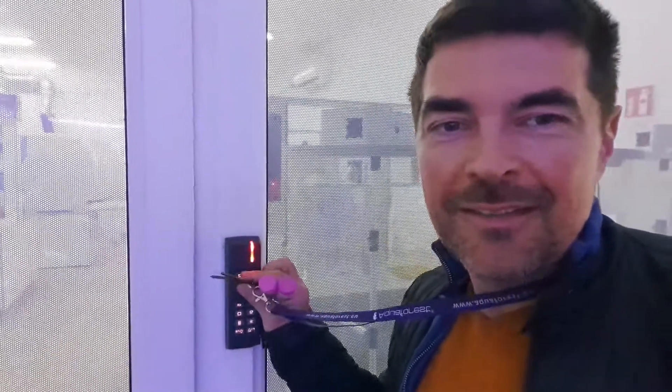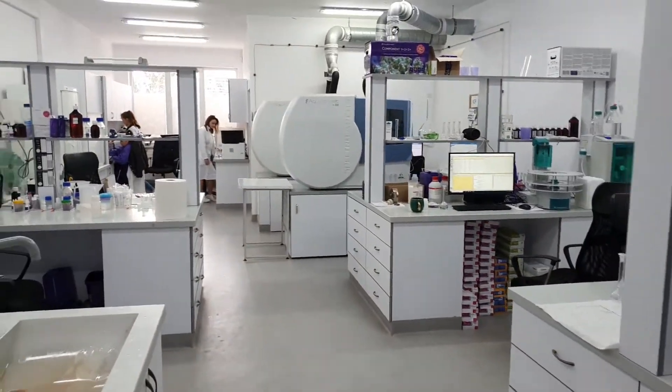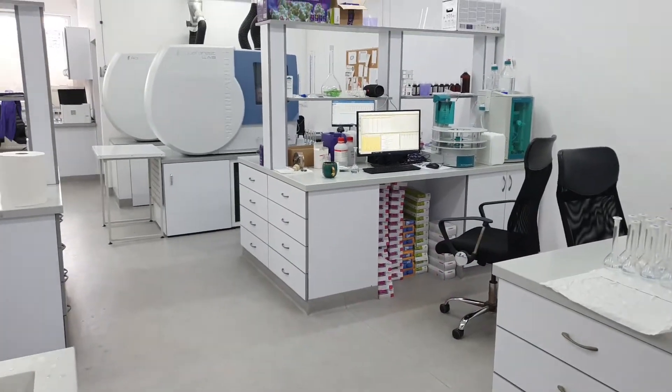So here you have the lab. I've done this video before, but this is the lab. I'll enter with the probe and with the dials and I'll show you how it is. And here we go. I will change the view of the camera. So as I told you, I will leave my vials, my samples.